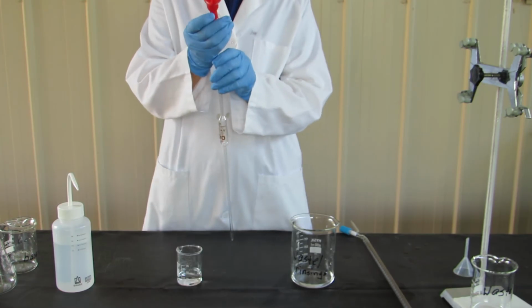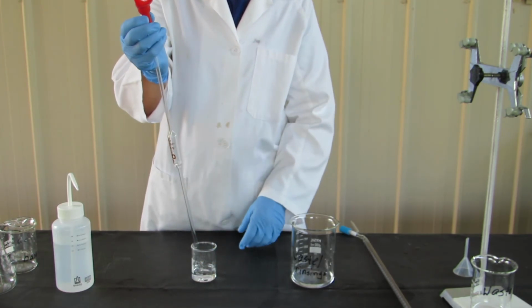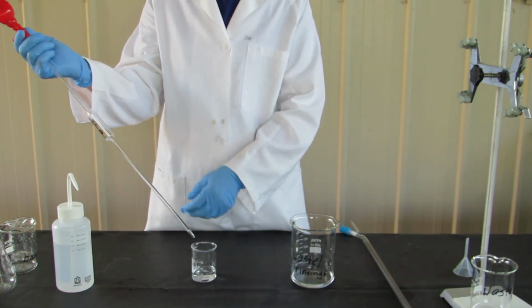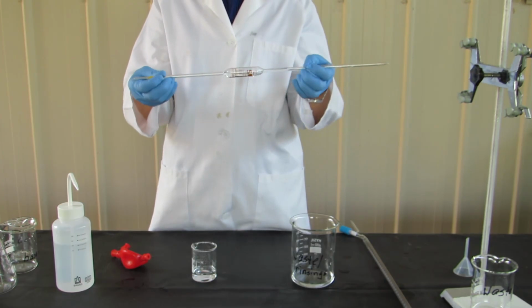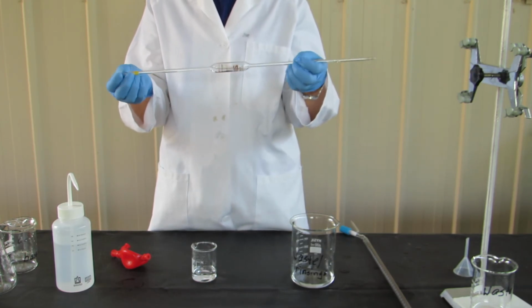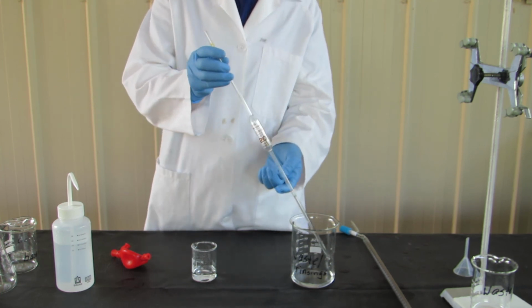The second valve in the centre here is used to suck. So we can take up, in this case, because I'm rinsing, just a few mils of distilled water and rotate to ensure that all the internal walls are rinsed, and drain into a waste container.